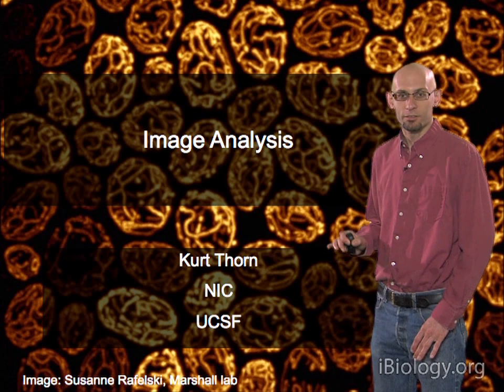And so here's a little bit of a tougher case. This is actually not a microscope image, but a dot blot. And you can see there's some really dark objects here, and then some objects that are clearly there, but they're not a whole lot darker than the background. And so setting the cutoff here matters quite a bit. If you set it too high, you miss these dim objects. If you set it too low, you start picking up a lot of background noise.